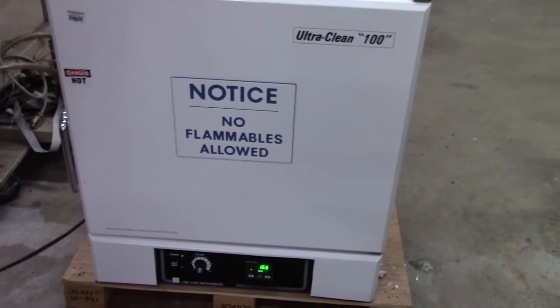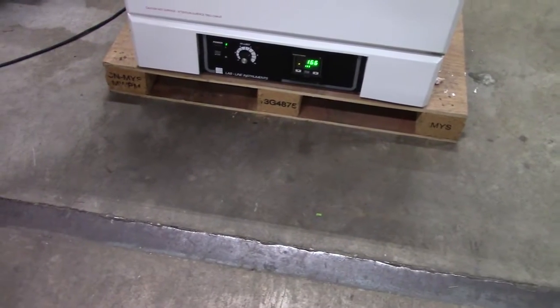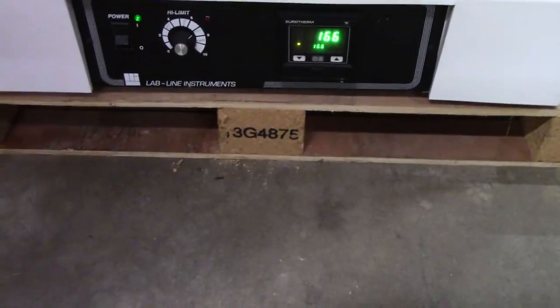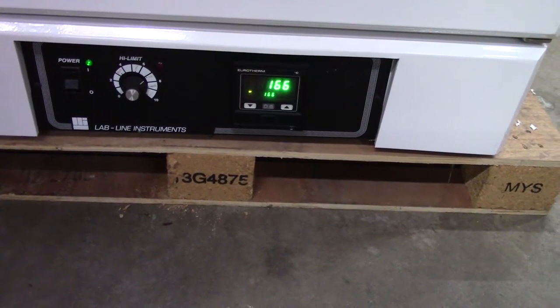Hi, this is Jim from iTechTrader. We're looking at the LabLine UltraClean 100 oven. The oven goes up to 250 degrees C. As you can see right here, we've had it on for a while. We've got the temperature set at 166 and it's holding steadily there.